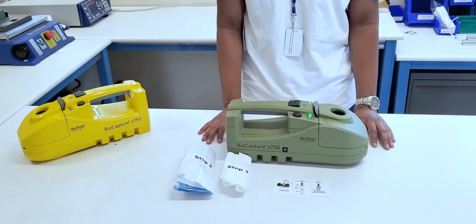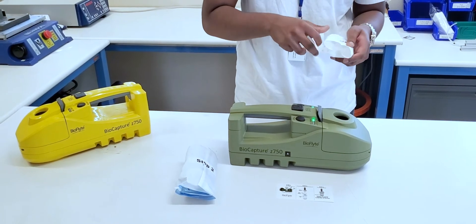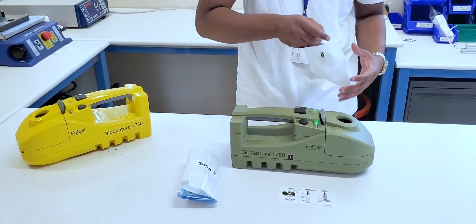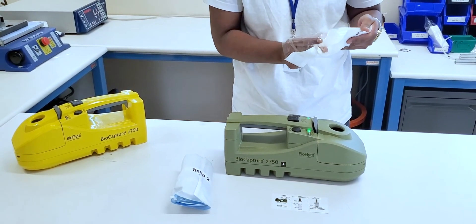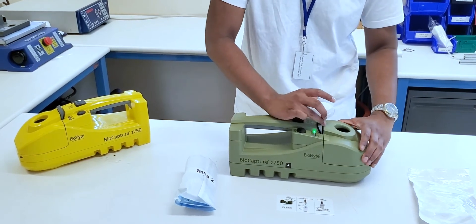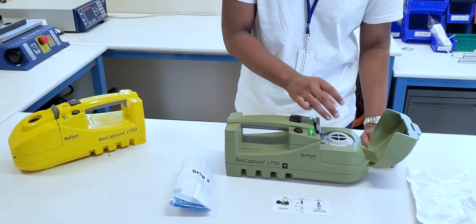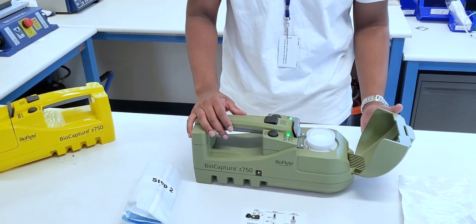I will now be demonstrating Step 1. The first thing that we need to do is open our Step 1 pouch and remove the filter from inside. We will then need to attach the filter. As you will see, the filter can only attach in one direction, and you'll hear it snap in when it's attached properly.